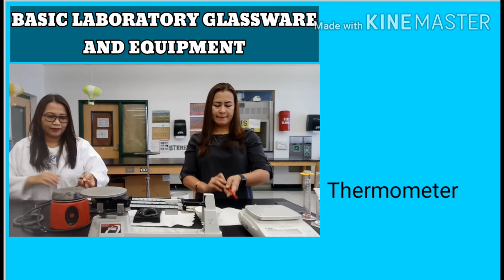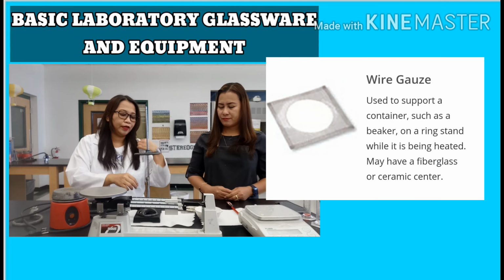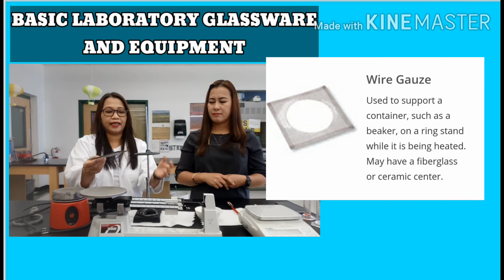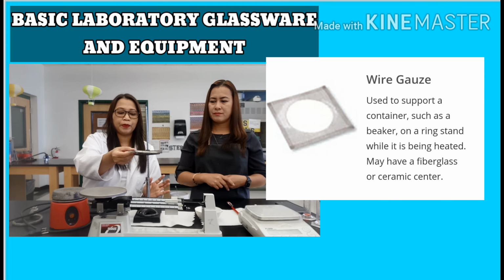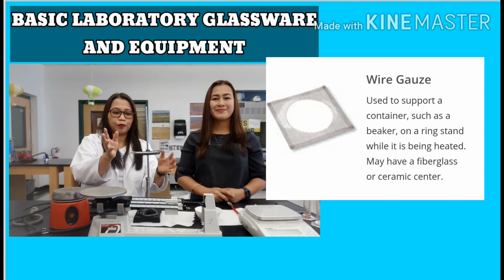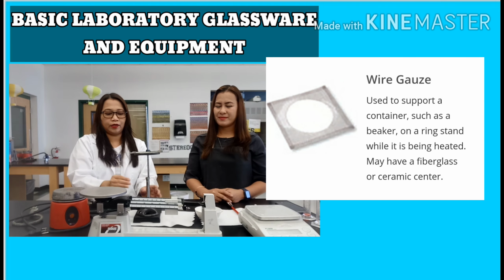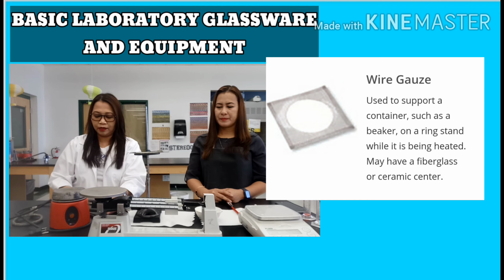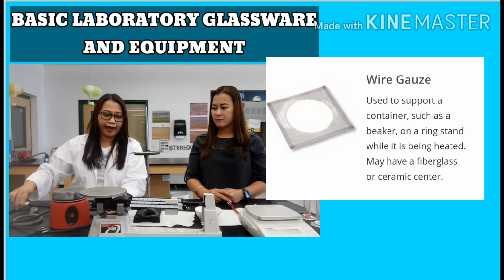And then also, we have here the wire gauze, the iron stand and the ring clamp. So if you will be using the Bunsen burner, this will be the setup. You put the iron stand here with the iron ring clamp, and then you put the wire gauze here, and then underneath you have the Bunsen burner, which should be connected to a gas.